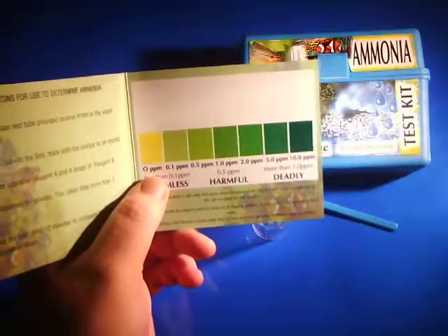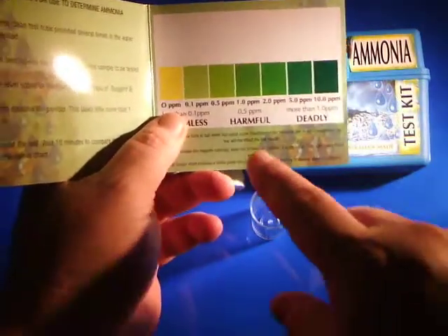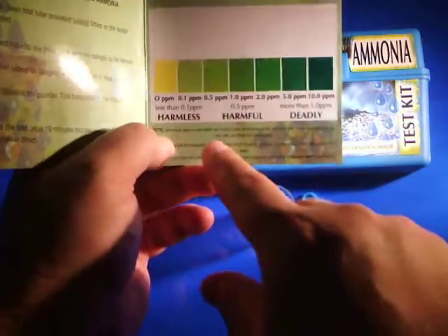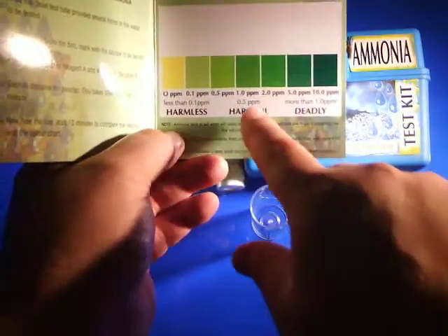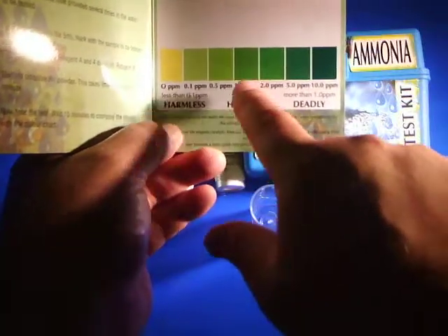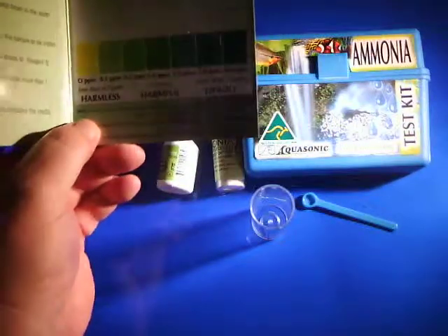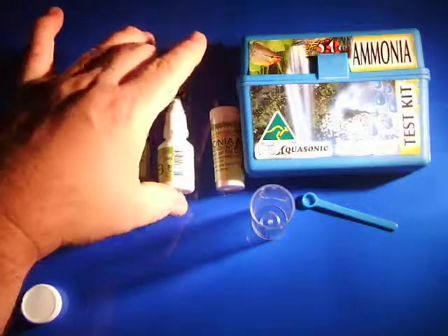Here's your colour test. As you can see, where it shows the yellow and the lighter green, that's really where you want your water to be — that's where it's going to be harmless for your fish. As you go up the scale into the darker green, it'll be in the harmful area, and then the deadly area. So it is a really good idea to have an ammonia test kit so that you know you've got a good environment for your fish.